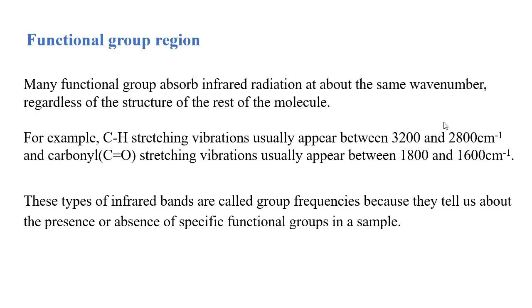And carbonyl stretching vibrations, that is C double bond O vibrations, usually appear between 1800 and 1600 centimeter inverse.